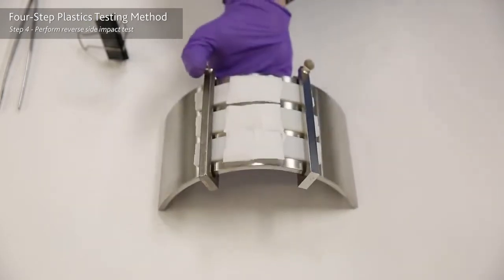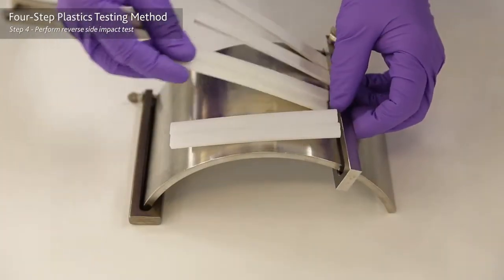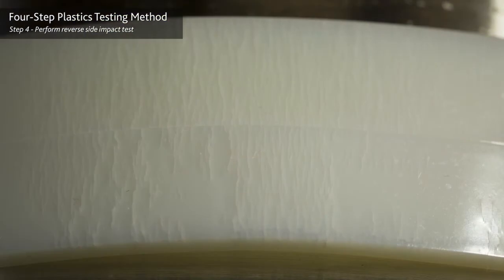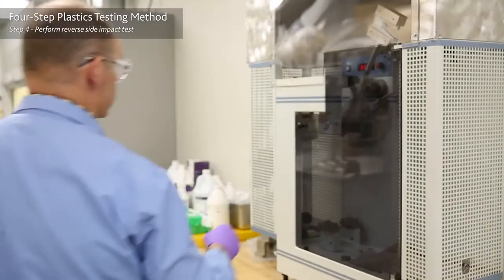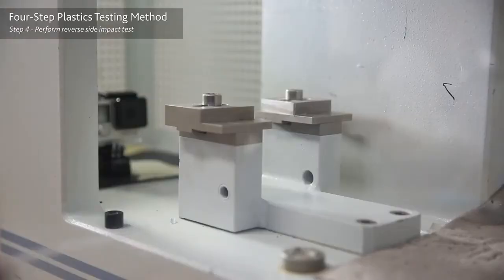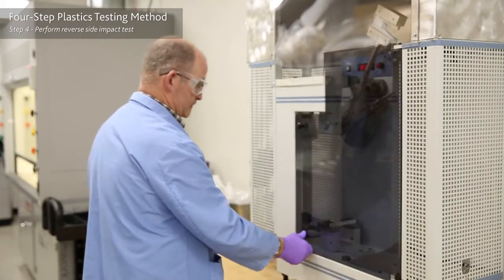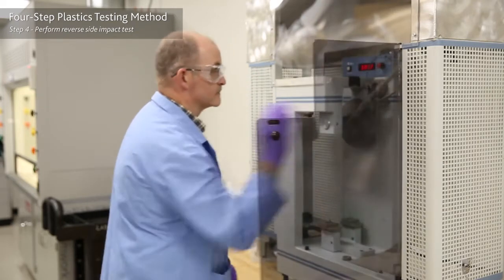Step four: unload the samples. You may already see changes in some plastics, but you don't want to stop there. There may be cracks or crazes that were not visible to the naked eye, or identified by weight or dimensional change. Run the reverse side impact test on the exposed and control samples.